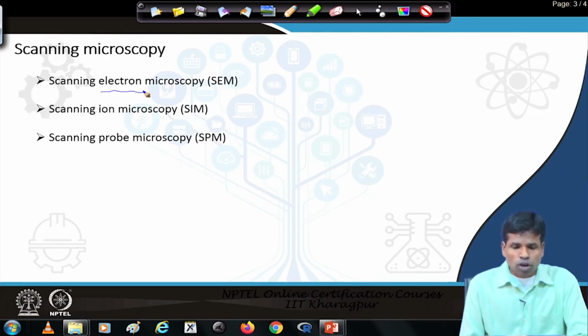because electrons have very small mass, and in the electron microscope we have several aperture lenses. They undergo diffraction, and that limits the resolution of the scanning electron microscope. Moreover, the electron wavelength is much smaller, therefore, the resolution is much higher or better than an optical microscope. Using an electron microscope, our wavelength can be 0.01 nanometer or less. Therefore, we could achieve a resolution of less than 1 nanometer using a scanning electron microscope.